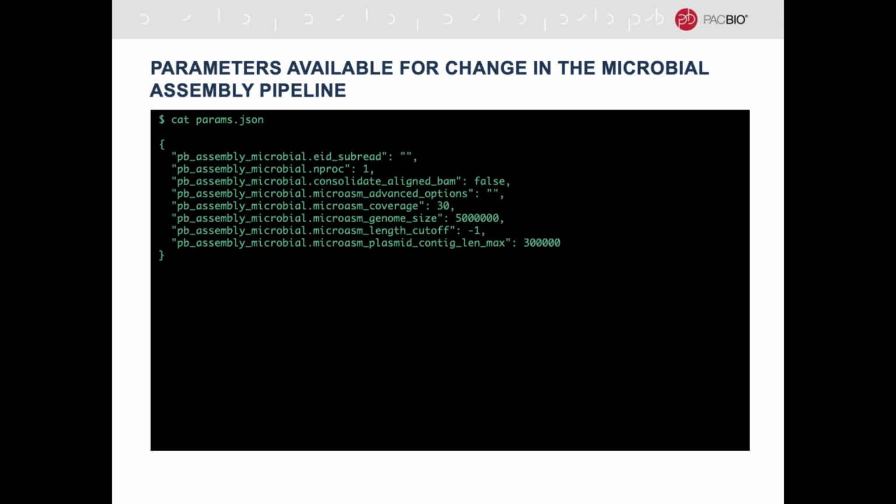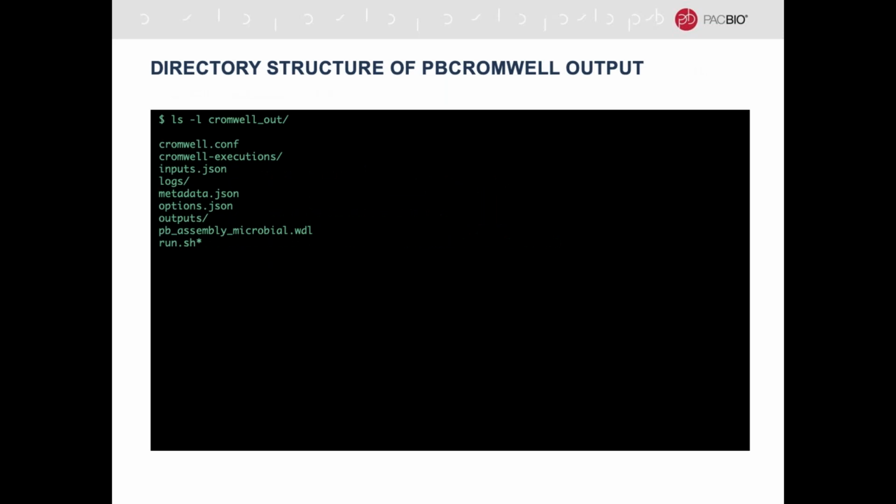As well, you can edit the coverage. Most importantly, the genome size needs to reflect your estimated genome size. And that's it. So again, not a ton of stuff to edit here, which is good. We want to keep it simple for you, but you can, of course, always modulate those advanced options if you feel like testing that out.